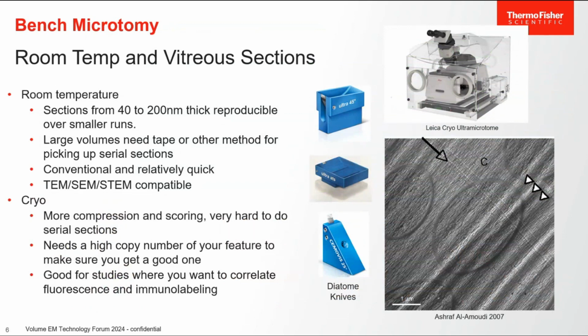But for room temperature, of course, we're still affected a little bit by the artifacts of sectioning. It's great with the innovations that we have now with microtomes and resin systems and other things that get rid of a lot of those artifacts. But ultimately, they are still quite hard to deal with in cryo conditions. So you still see that quite a lot. So while microtomy, I think, is perfect for room temperature, and it obviously allows it to be very accessible, for cryo, it still has some applications. We're seeing a lot of growth in cryo conditions with vEM because it avoids some of the artifacts that you get there.